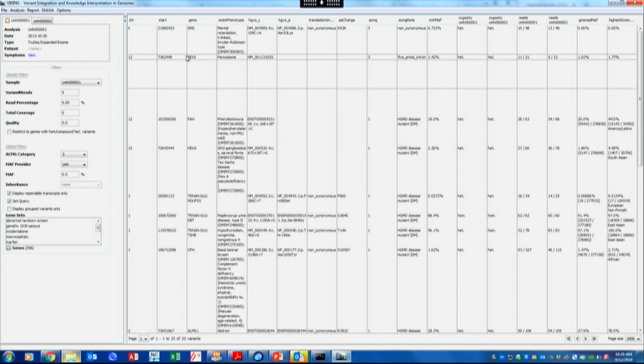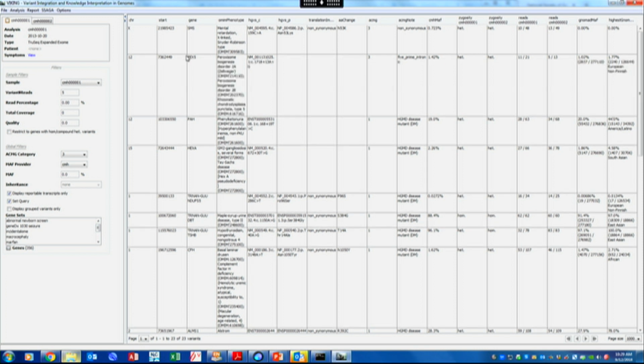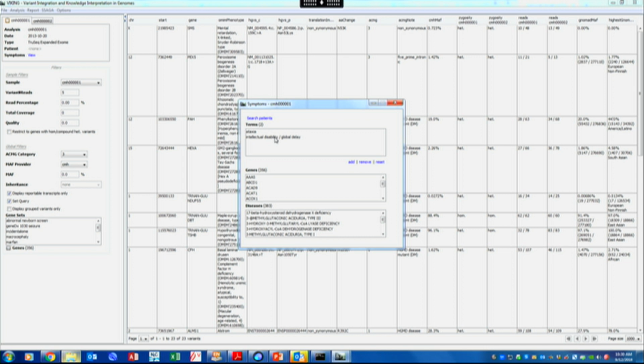Okay, so I still have 23 variants, but that's out of... Oh, I did? Oh, that's why. Okay, thank you. I'll take that out.